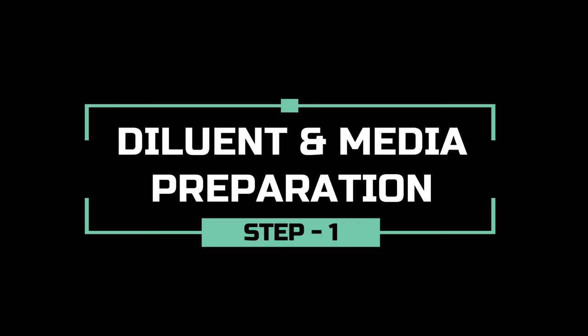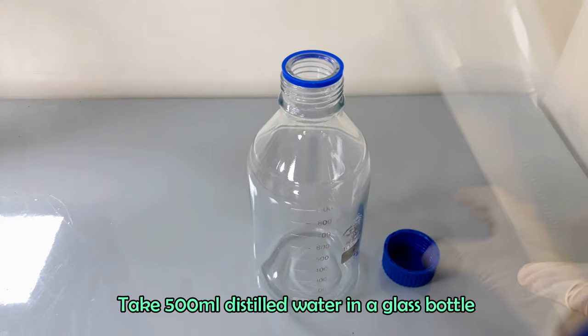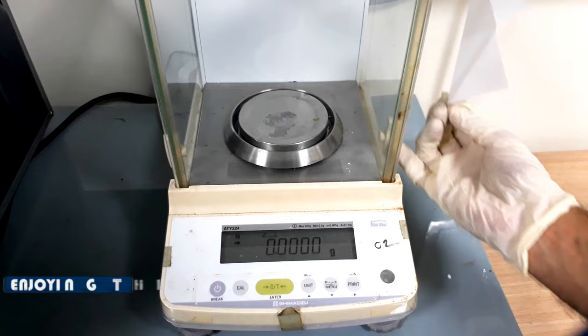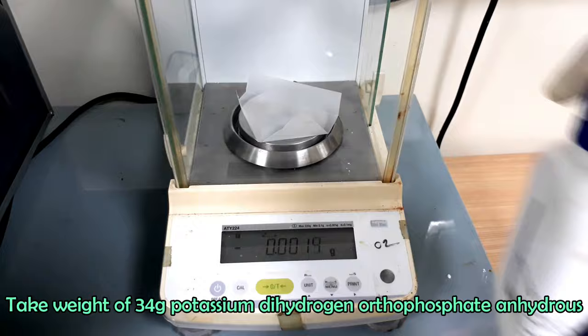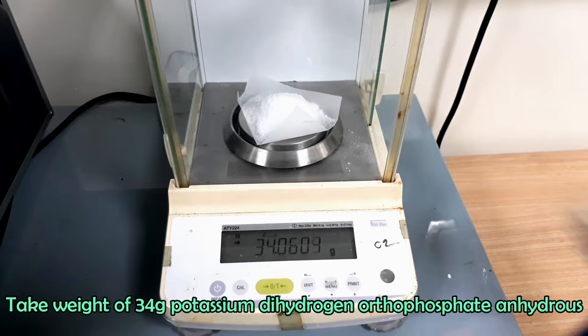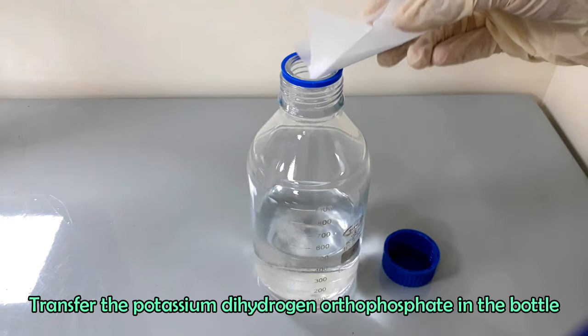At first, we will prepare diluent and culture media. We will use Butterfield's phosphate buffer as diluent for this test. To prepare Butterfield's phosphate buffer, take a weight of 34 grams potassium dihydrogen orthophosphate anhydrous. Dissolve the potassium dihydrogen orthophosphate anhydrous in 500 ml distilled water.